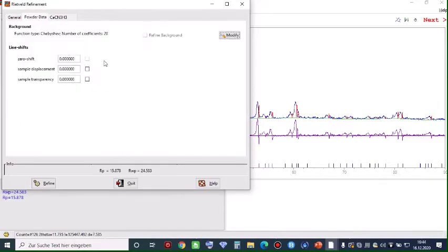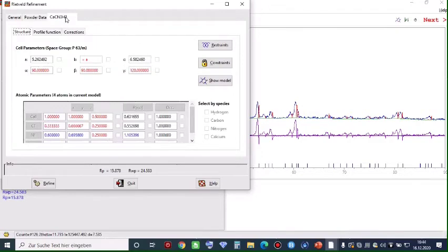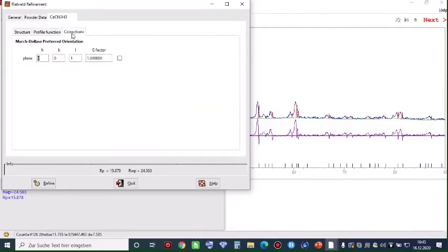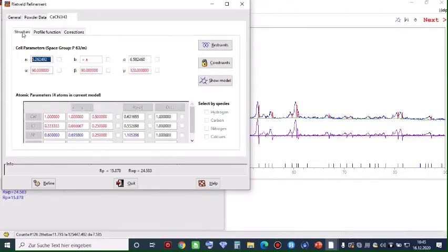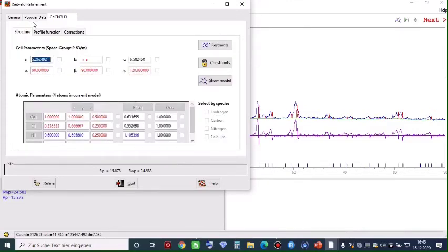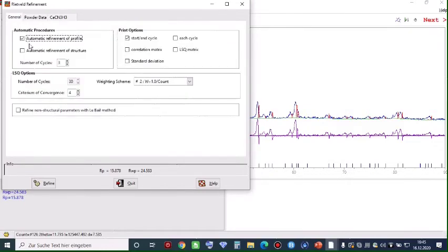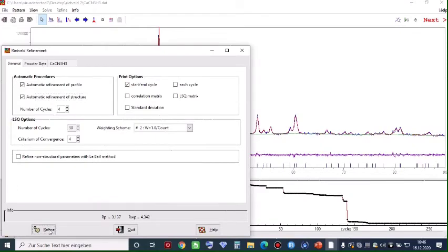Go back and move forward to Powder Data — leave this section the way it is. When you come to the profile settings, you have to choose the profile function, which is pseudo-Voigt. In Corrections, you don't need to touch anything. Go back to Structure — everything is OK. Check once more the Powder Data and General settings. You have to choose the profile function of structure, and then click on Refine.